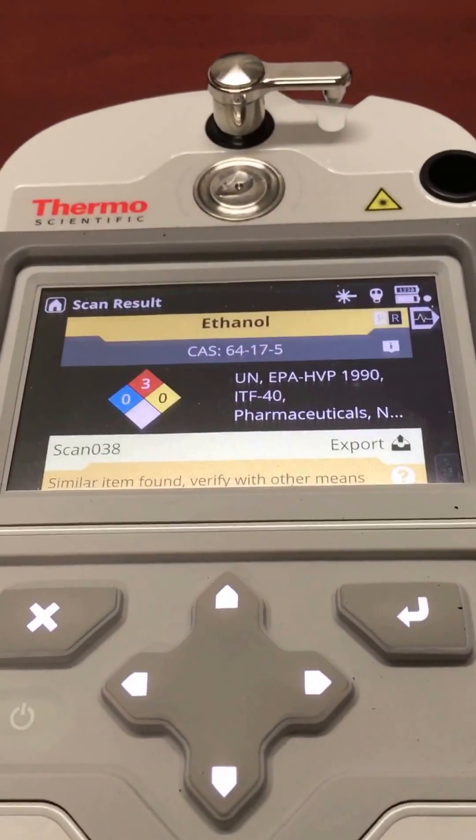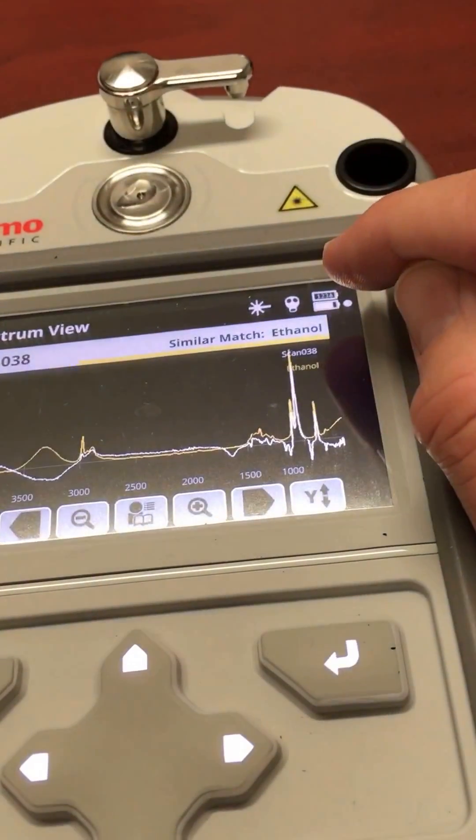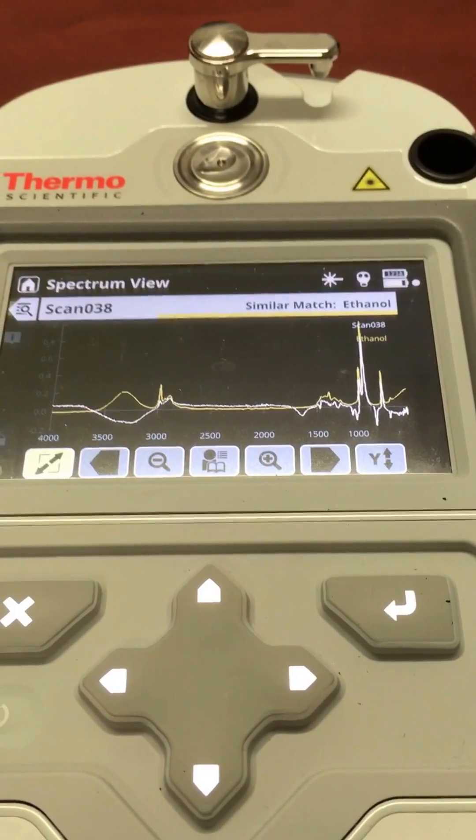And it's picked up ethanol. Click on that — you also get your result in the waveform. Anvil is in the waveform.